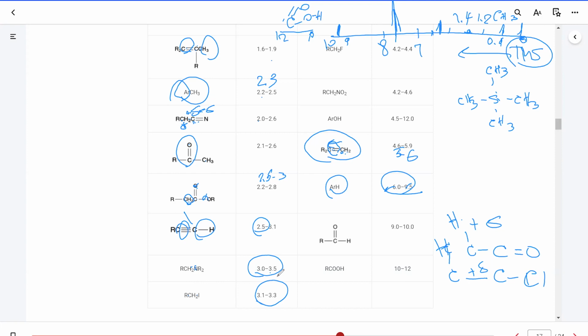If, for example, you were trying to make an aldehyde, did the aldehyde functional group form or not? If you were trying to make an alcohol by reduction of the aldehyde, a broad and short peak between 1 and 6, that's the indication that alcohol has formed.